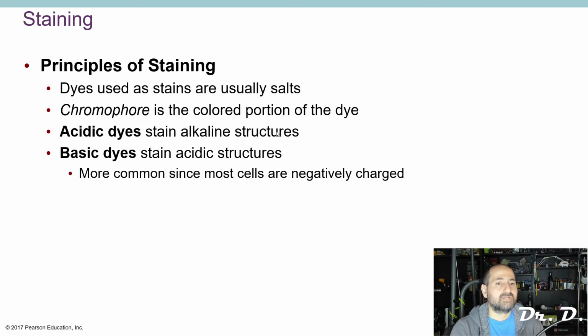Positively charged substances are basic or alkaline. Basic means alkaline. So basic or alkaline structures or dyes are positively charged, and acidic ones are negatively charged. And remember how charges work? Opposites attract. If you have a negatively charged dye, it's going to want to stick to positively charged molecules or specimens.